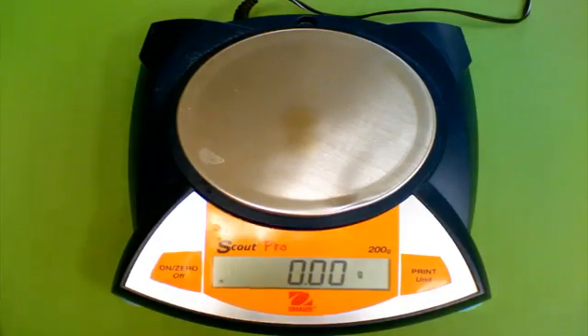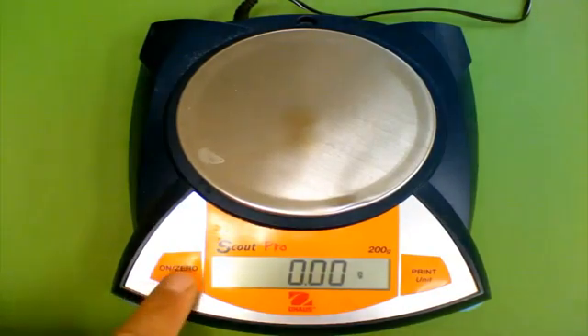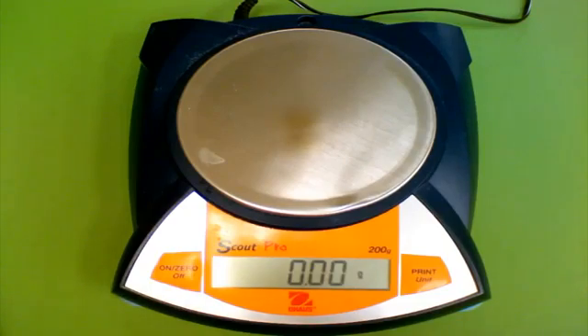Once it's warmed up, you'll see a zero — you should see 0.00. When approaching the balance, regardless of what numbers you see, it's good practice to press the zero or tare button, just so that you know you're starting out with a zero value.